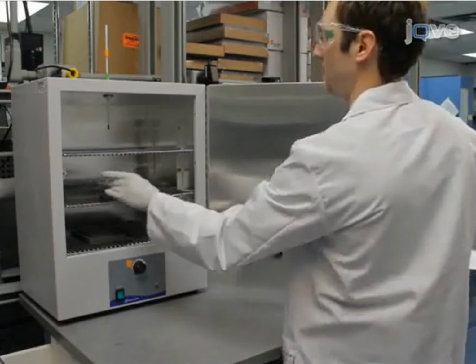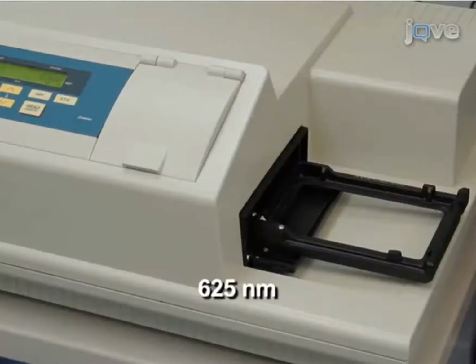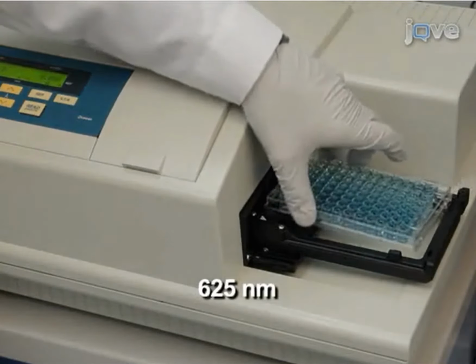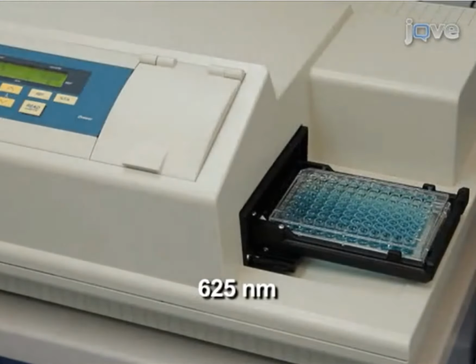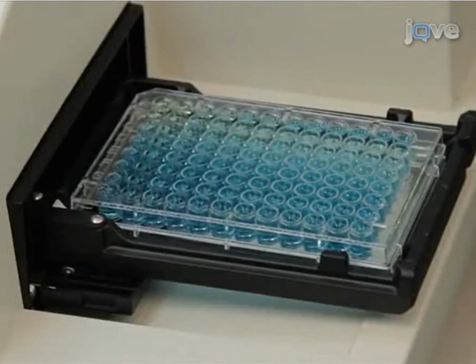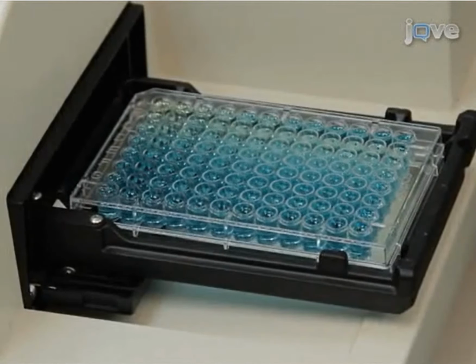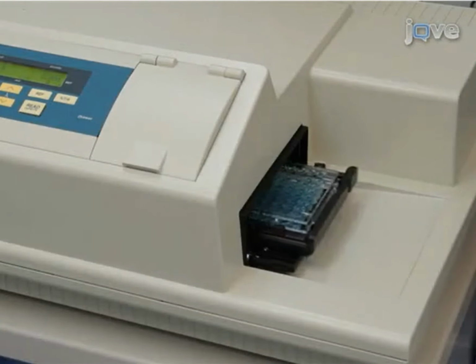When heating is complete, let the plate cool to room temperature and shake thoroughly. Read the absorption at 625 nanometers using a microtiter plate reader. The content of glucose, the building block of cellulose, is calculated based on the absorbance compared to the standard curve established on the same plate.